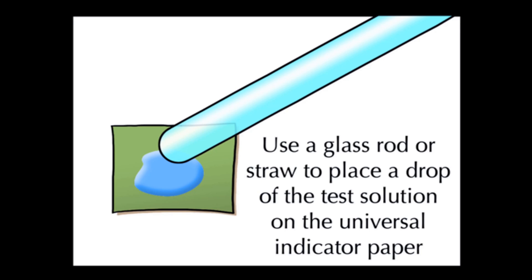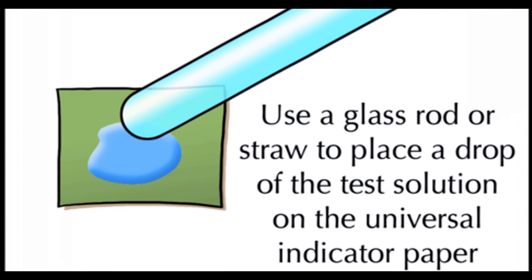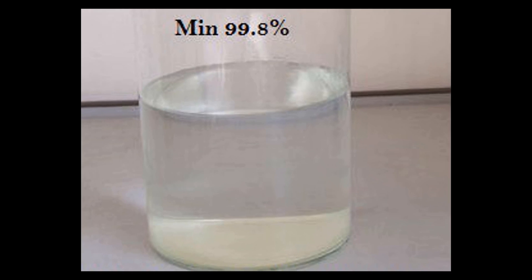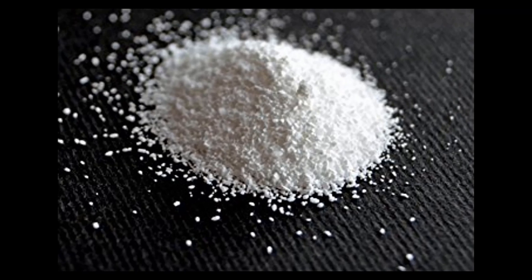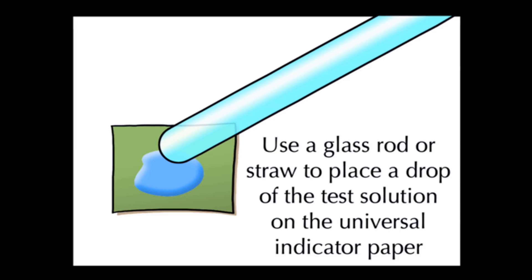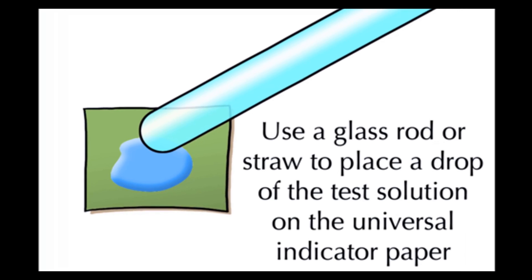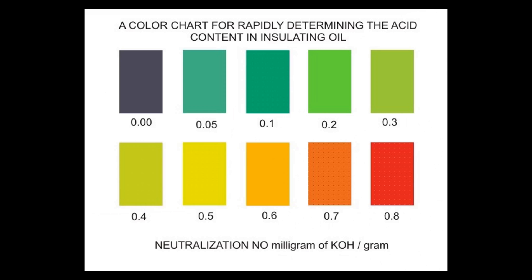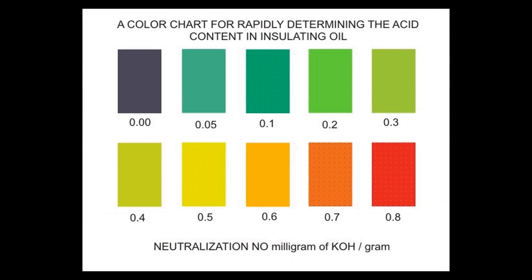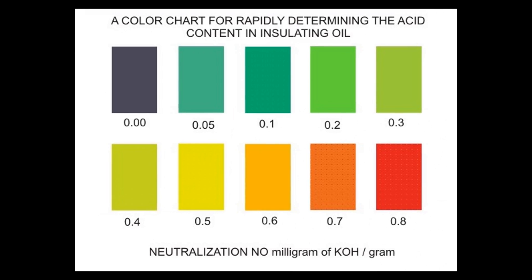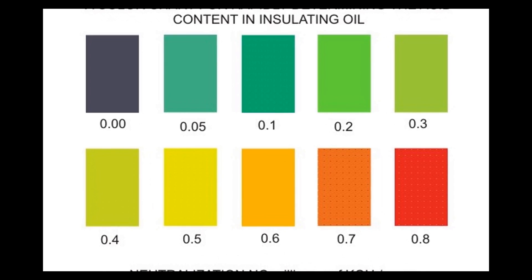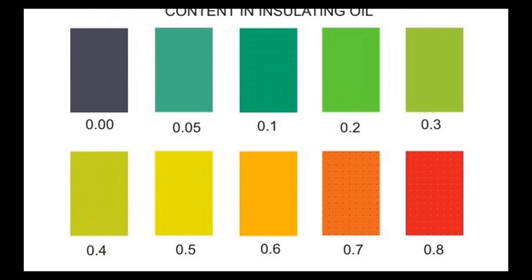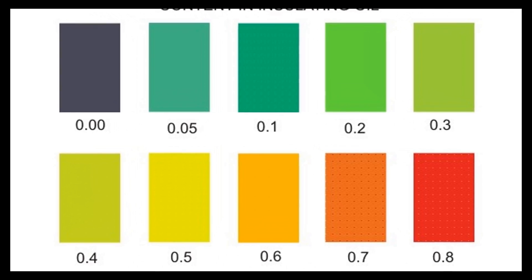At last, after reshaking the sample mixture, we add 5 drops of universal indicator to the sample. Observation: the color of the sample oil after mixing rectified spirit, sodium carbonate, and universal indicator describes the value of acidity of the oil sample in milligrams KOH per gram.